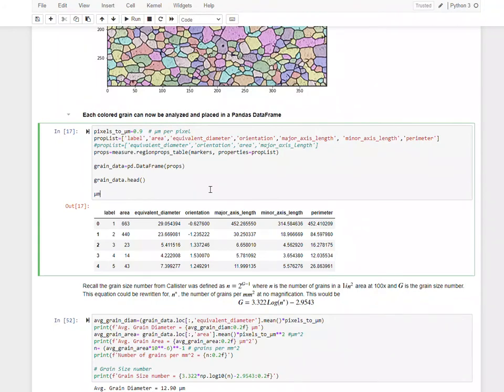All right. This Greek letter you just saw me use sometimes shows up in some of the names I might use. You can use the Greeks. The way that you get those is you just type this backslash. I always confuse which one's back and which one's forward. But we use this one, and then you just type in the Greek letter you're looking for. So maybe you really want the Omicron, and then you just hit the tab. Of course, I probably misspelled that. If I just do the slash and hit tab, it'll come up with a menu, so you can go through and pick whatever one you want.